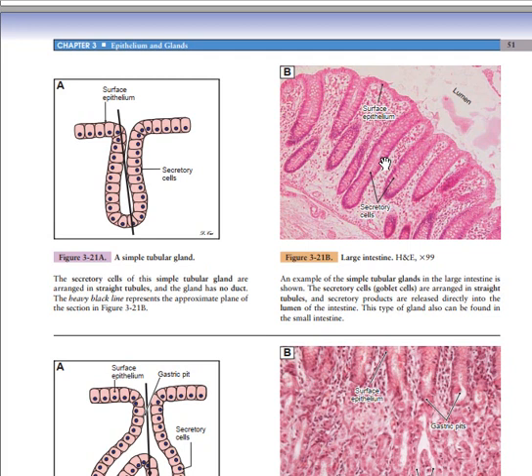And then you also have the last one, which is a sebaceous gland, where it is all whitish around. There is no apical part that is whitish; more than the base, it is whitish all around for the sebaceous gland. So that is when you want to find the function, but for the morphology only, this one here is like a tube. Since it resembles a tube, and the cells are inside, this is why it is called a simple tubular gland.